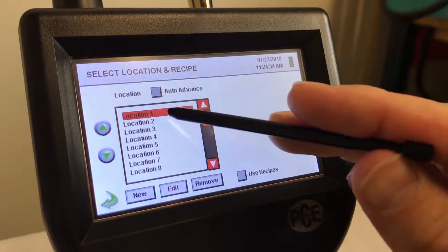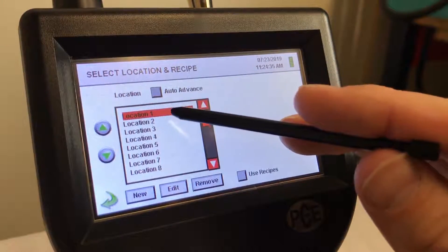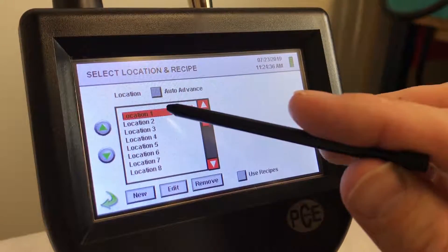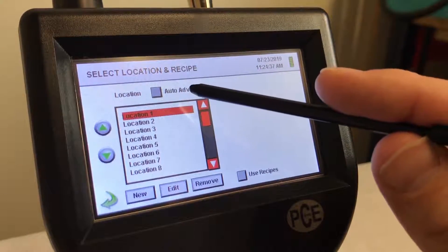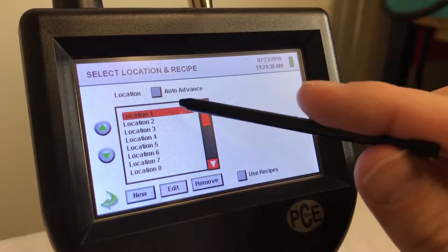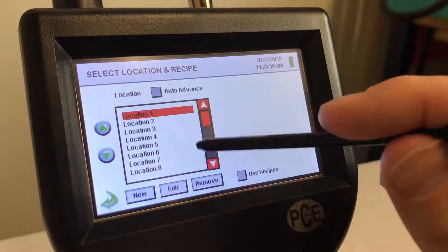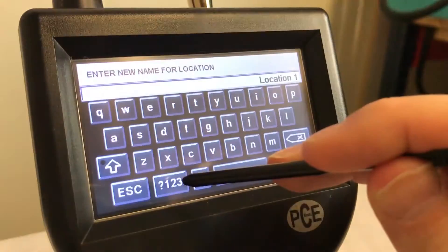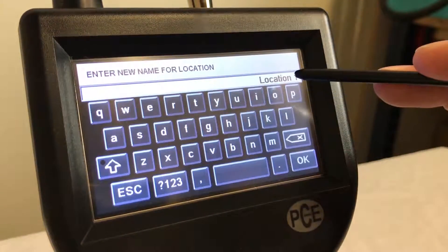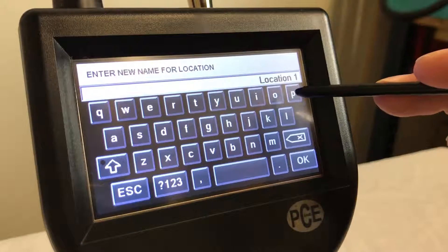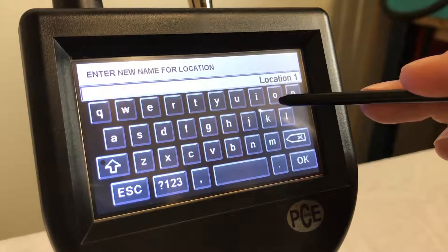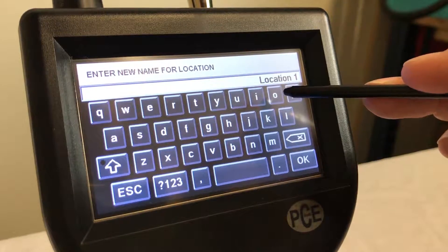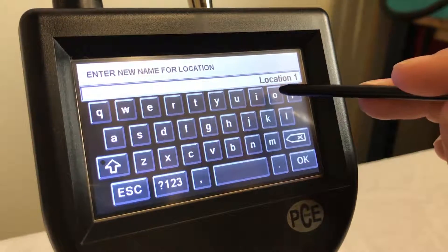You can name certain locations. So for example, if you wanted to make location one an office, you could go ahead and edit it and change the name.